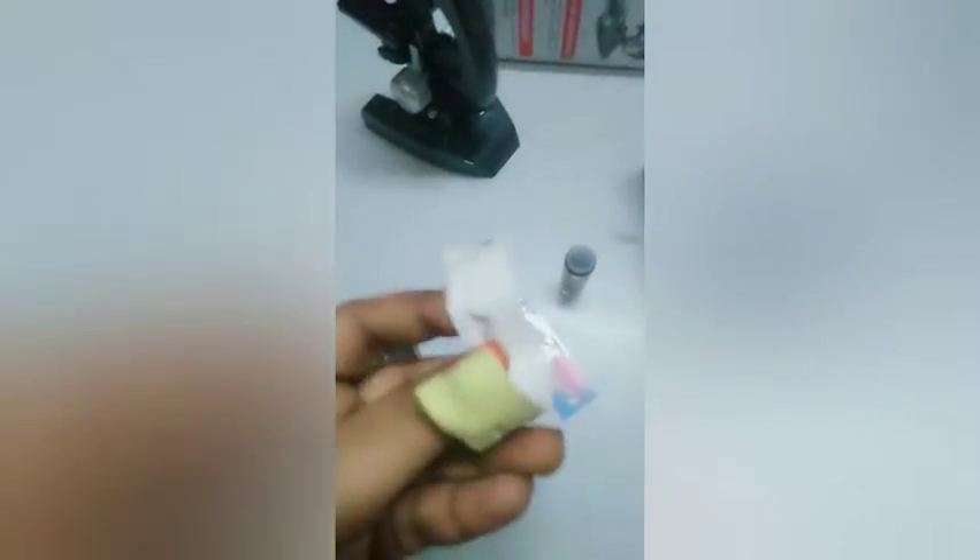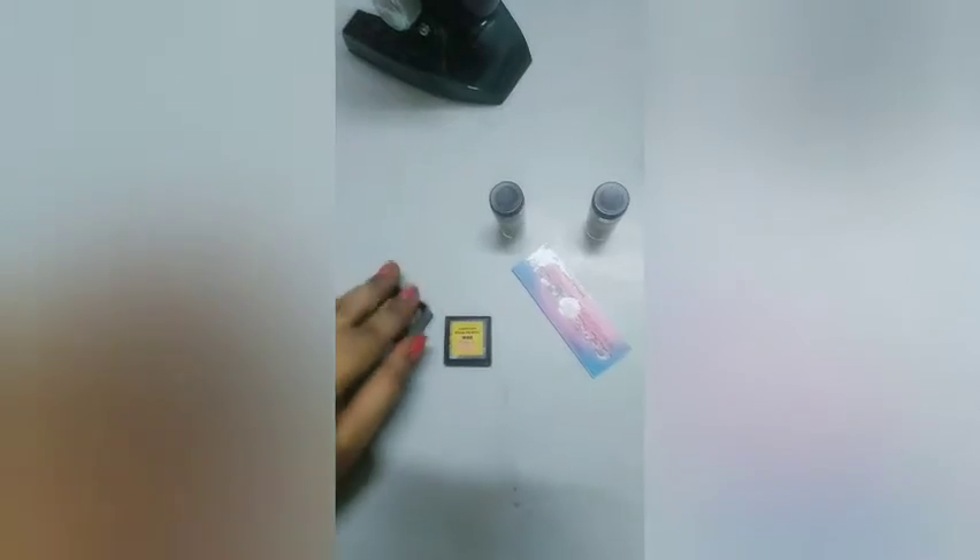Then we got a paper like this — you can see some holes are there, but the focus is not coming well. I don't know exactly what they have given because I have not used a microscope before, so I will tell you what that is. At the bottom we are having the place where we can put the battery.